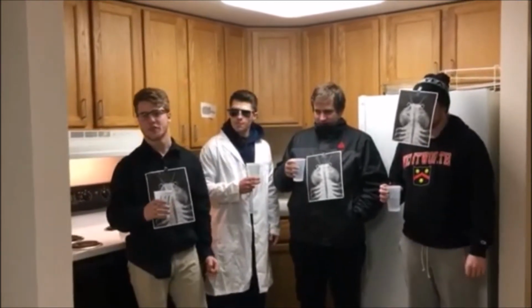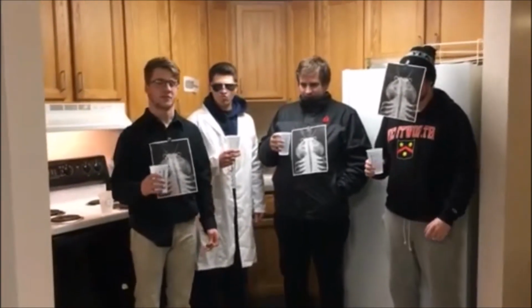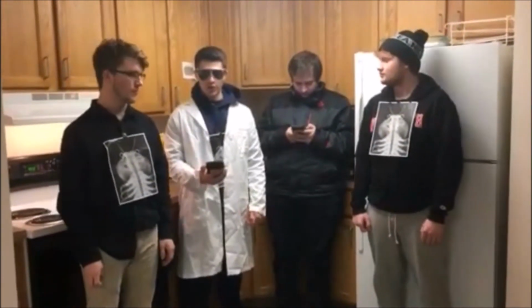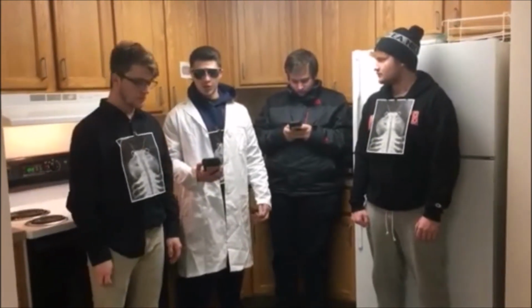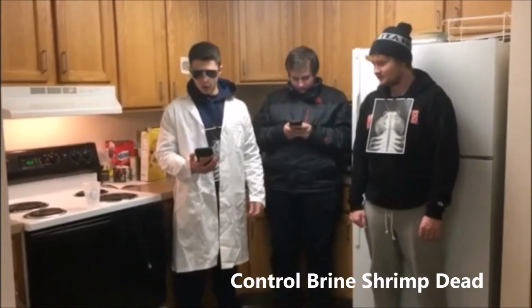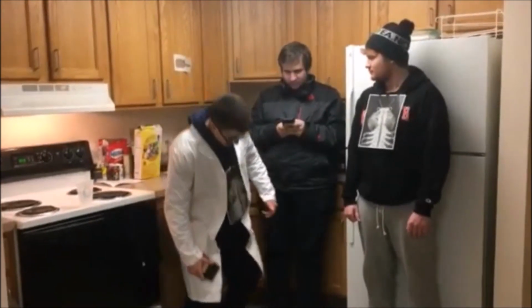We use brine shrimp in this lab because they're filter feeders, so toxins get into their system a lot faster, so it's easier to study the LC50 and similar measures. Our experiment tested the effects of different solutions of nanoparticles on brine shrimp. This applies to the LC50, which means the lethal concentration of a solution for 50% of the population over 24 hours. Our experiment tested this by placing 10 shrimp in 4 different solutions and 1 control and waiting 24 hours before observing how many shrimp were still alive in each group compared to the beginning.